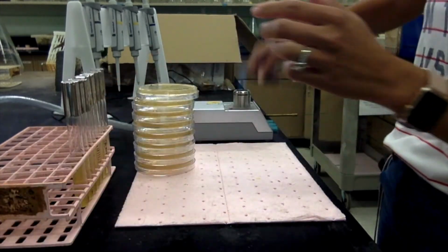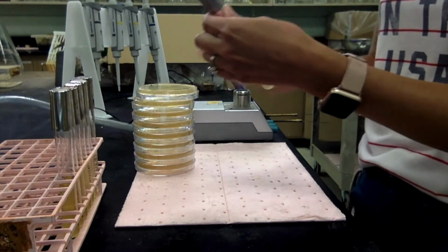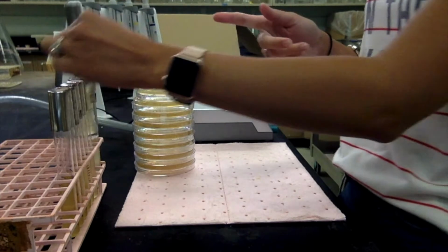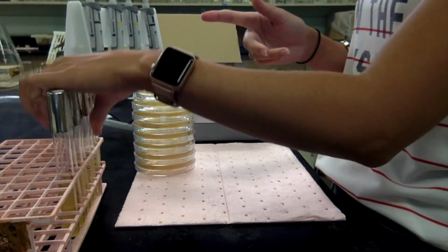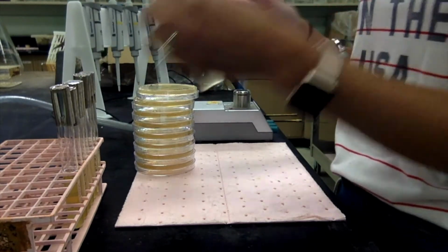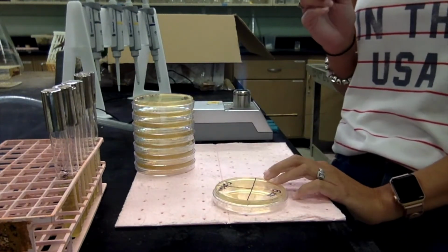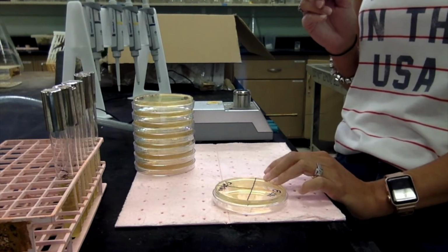Also, you want to give your bacteria just a little mix before you streak them, because sometimes the cells like to settle at the bottom of the tubes, and we want to make sure that we've got it all mixed. I'm going to do all 8 of these, but I'm just going to show you the demonstration with one of them, okay? So my loop is cool. Always keep your plate inverted while you're doing this, because you want to prevent airflow. We want to prevent contamination.